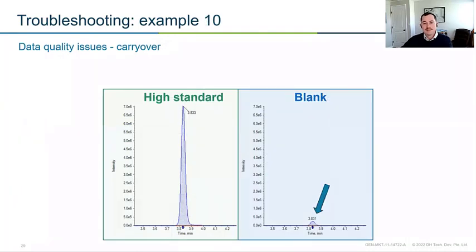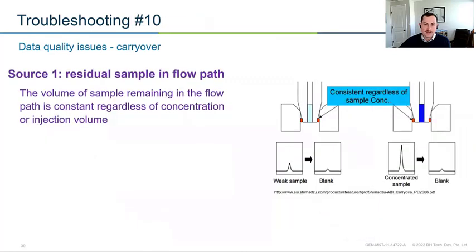And for number 10, this is actually one that was requested last time we asked some of the questions, and this was about carryover. So we had run a high standard, and now we've run a blank, and we have some carryover that we need to address. Well, there are two main sources for carryover, and they present pretty differently.